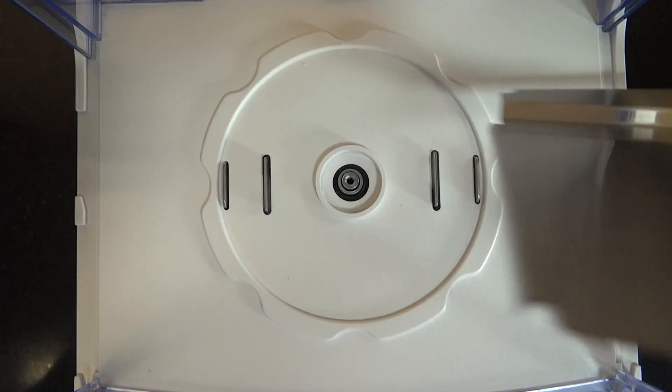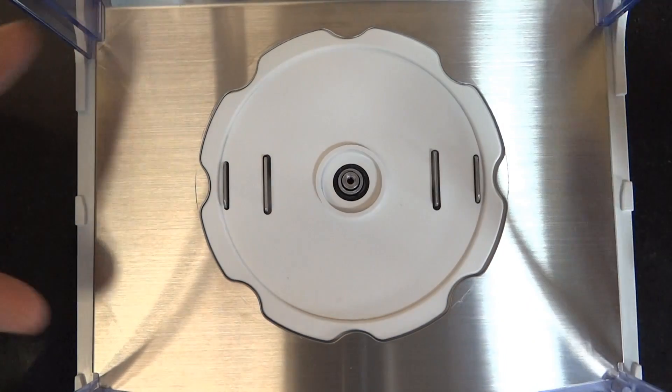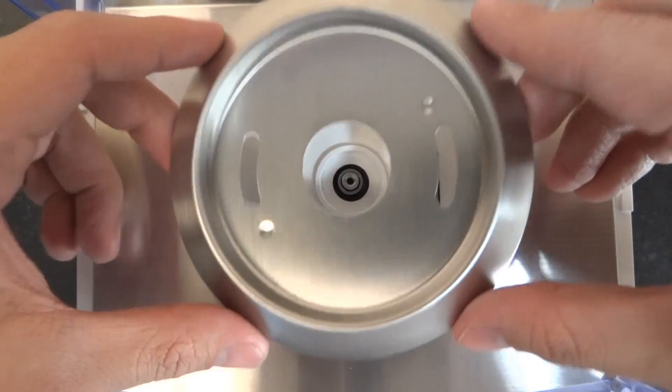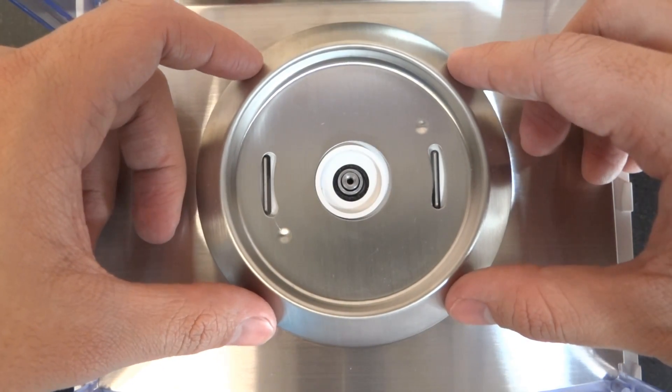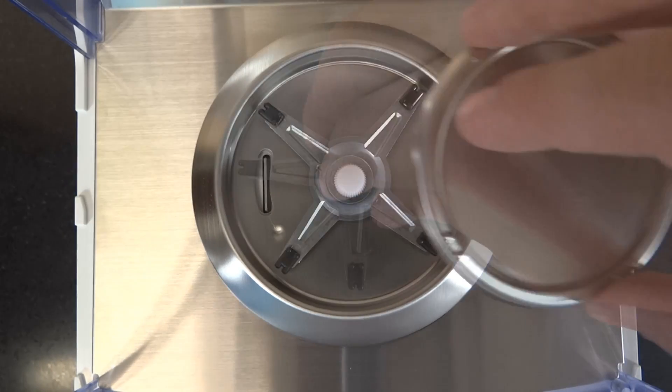The weighing chamber's floor is lined with stainless steel and fitted with a spill ring to prevent contamination from entering the housing, an anti-buoyancy plate to prevent air currents from interfering with the weighing results, and a 3.1 inch diameter platter.